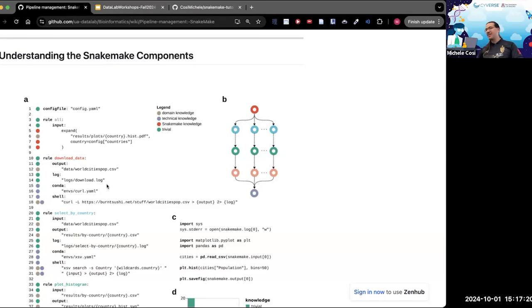I hated the fact that it needed me to express every output in the first few lines, because I'm not sure what the outputs are going to be. But things have changed. It does not require every single output now.